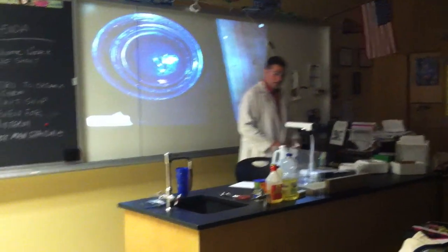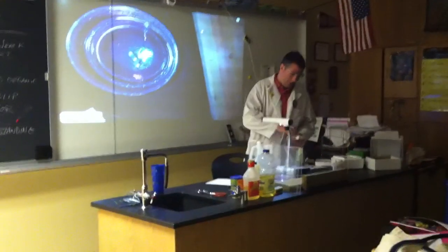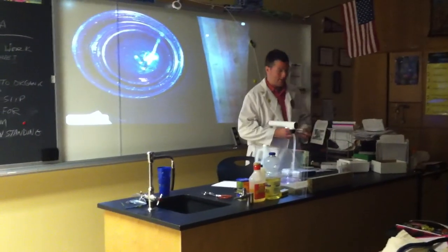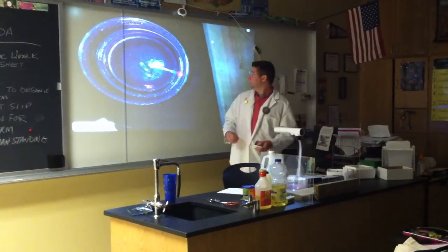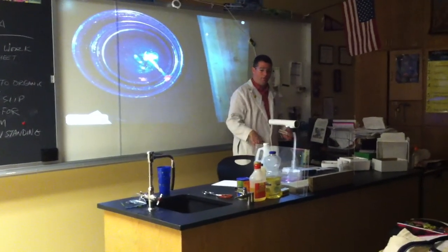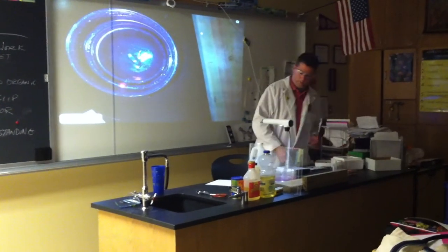Alright, we do have a slight color change. So you can see the gas coming off of there. That's actually hydrogen gas. And if I wanted to, I can actually light that on fire because just like the Hindenburg, that gas is flammable and actually explosive when you get it into tight confines.